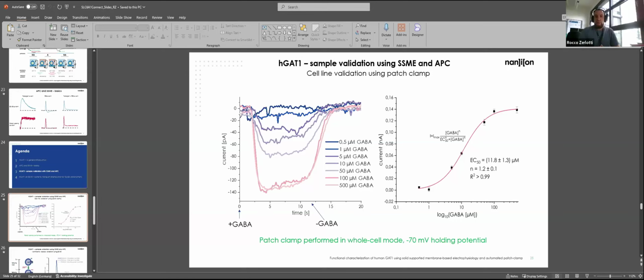So there are ongoing measurements for that. Hopefully in the future, if we tweak that out, we can also use neurons. Of course, I know that culturing neurons is very difficult, so it would be quite a challenge, I can guess.